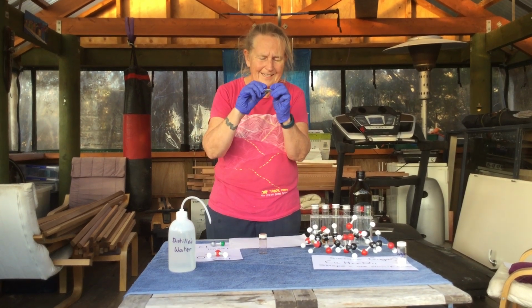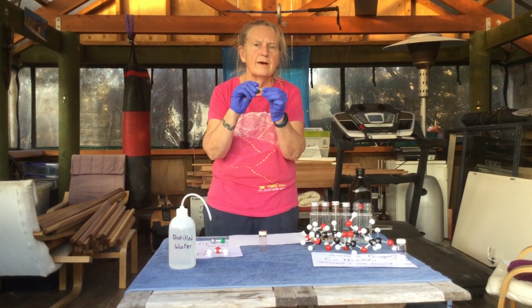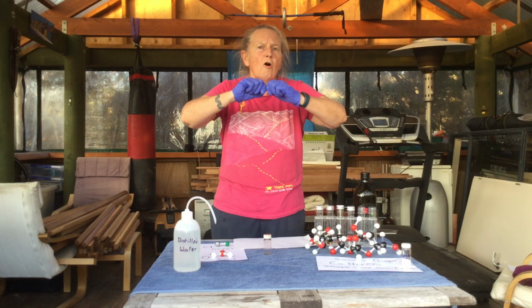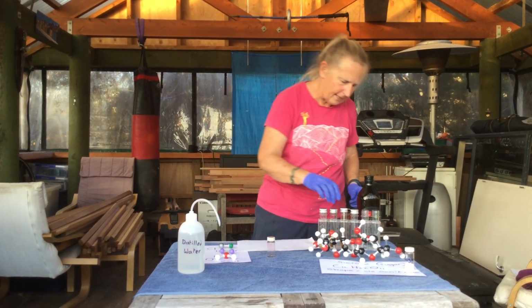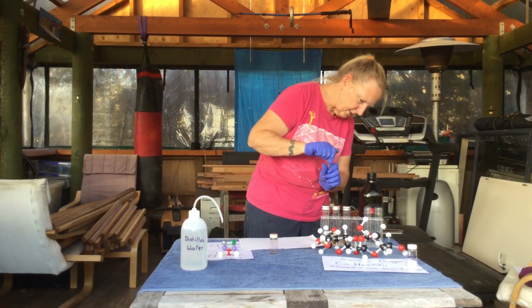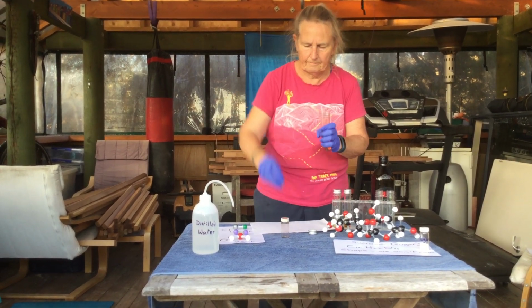So this has exactly enough pulling power that it would form an ionic bond if it were with a metal, but because it's with another iodine atom, they both have equal pulling power, and so they're both tugging equally on that shared electron, and that makes it a covalent bond, and that makes it insoluble in water. So there's my water, not soluble. I'm going to pour this water on top of this oil, which will help you to see the difference.